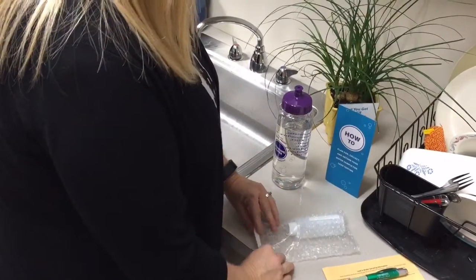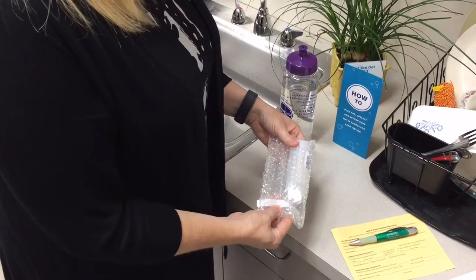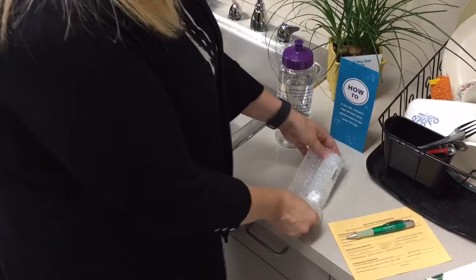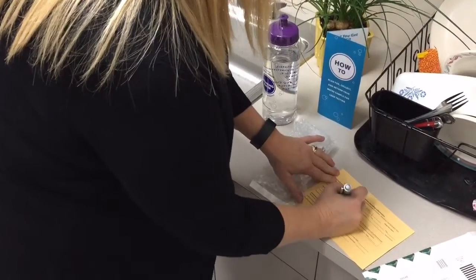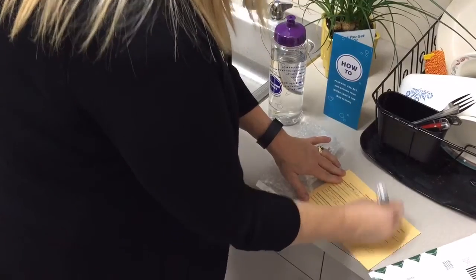Place the small sample bottle inside the 4x6 clear bubble lined wrap and seal the bag. Complete the information card about the sample. Don't forget to complete the time and the date, and to note if collected from the kitchen or bathroom faucet.